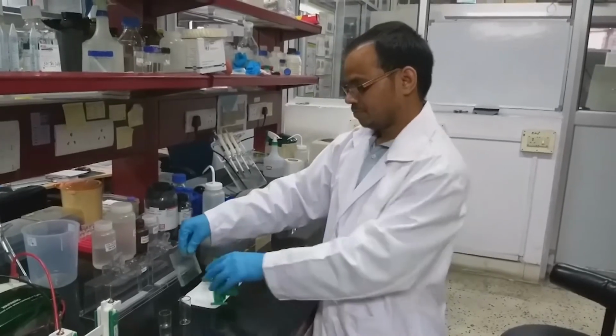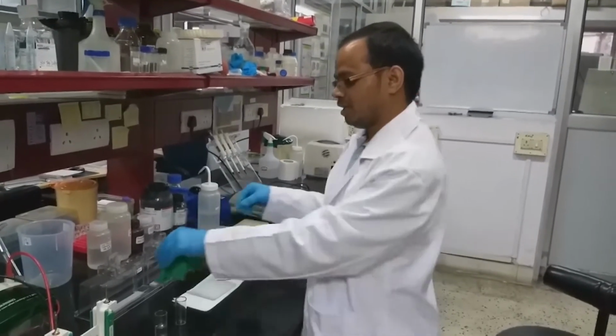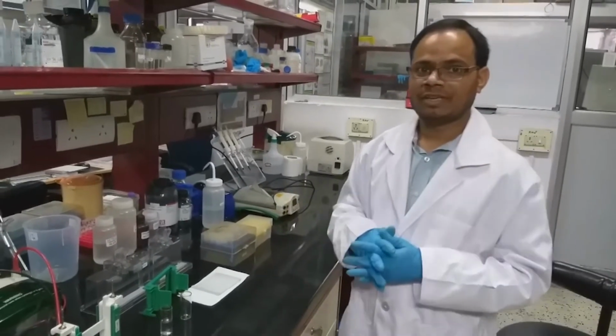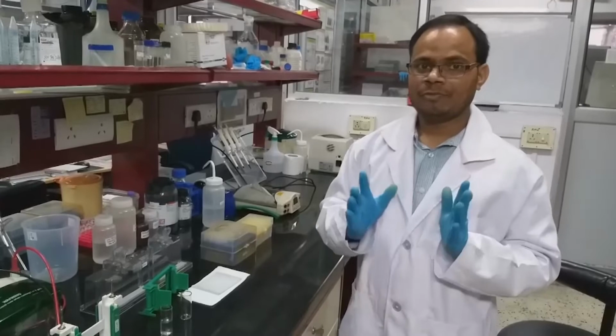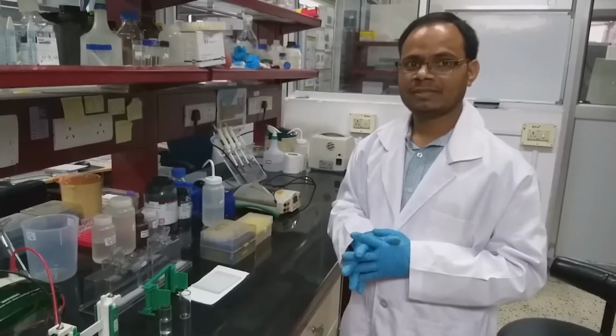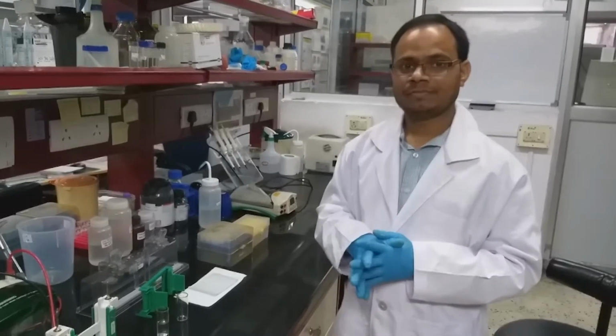Before doing that, we need some reagents. So what are those reagents? The first reagent we need for this experiment is acrylamide.